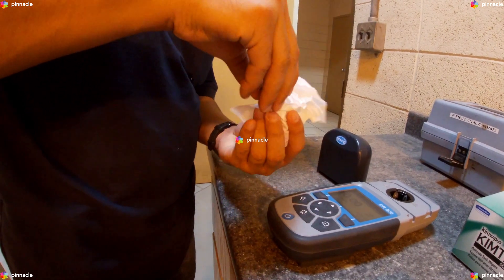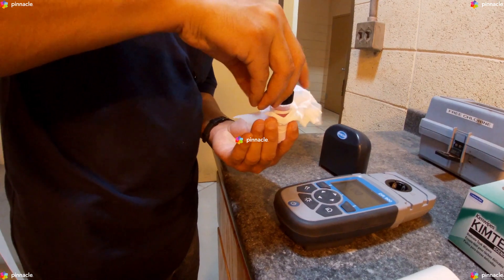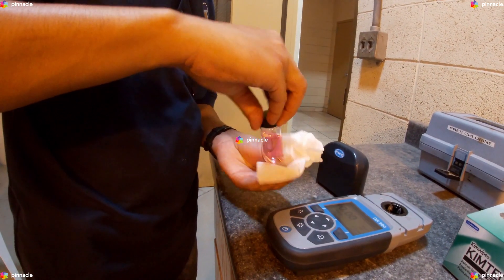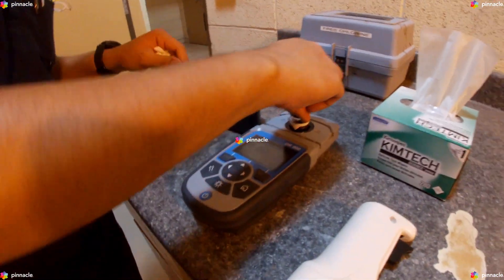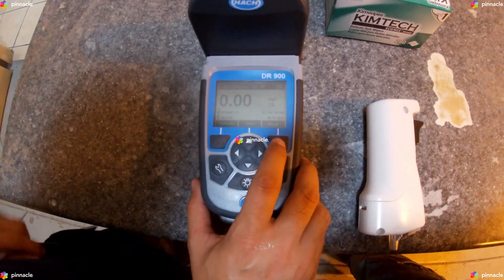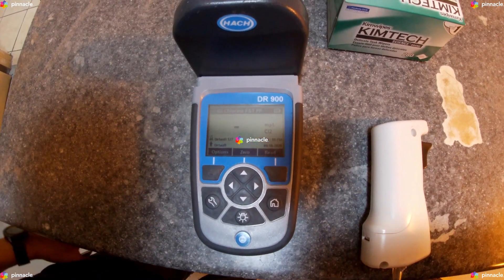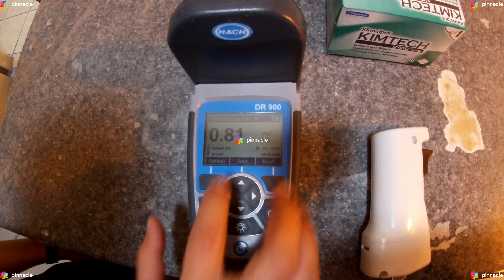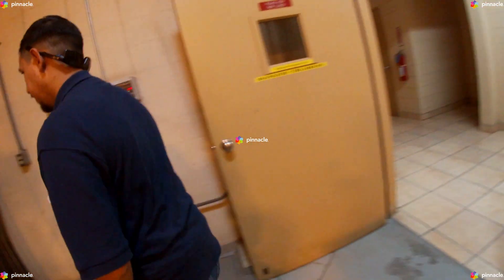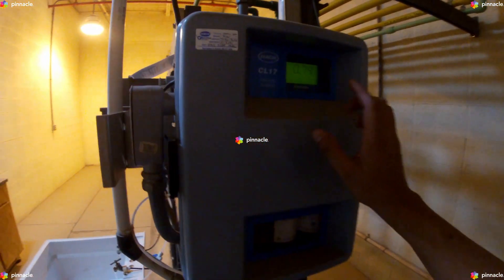And within 60 seconds of the reagent addition, insert the prepared sample cell into the cell holder and push read. The results are shown in milligrams per liter of chlorine. We will then compare our DR900 pocket colorimeter results to those of the CL17.